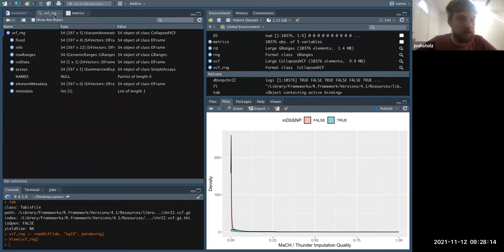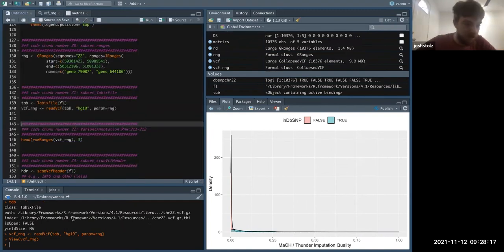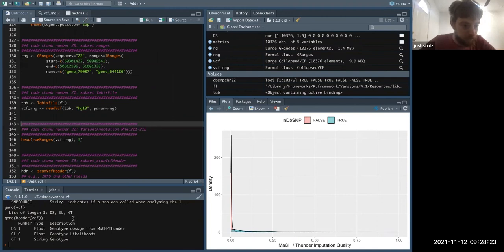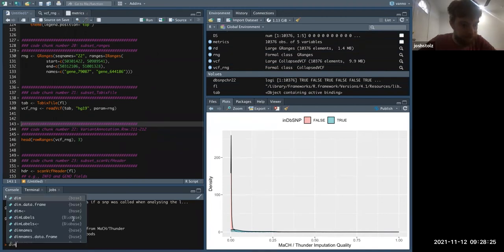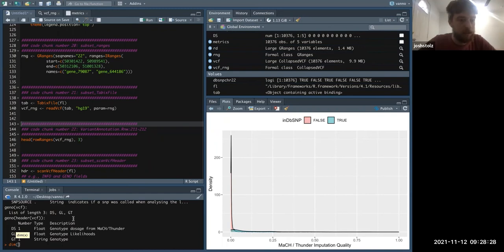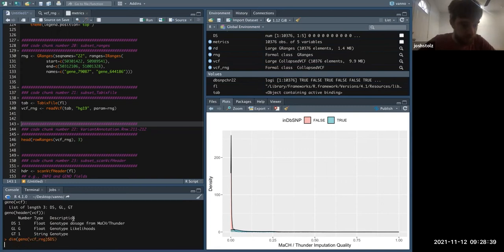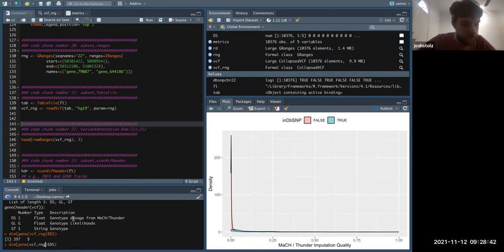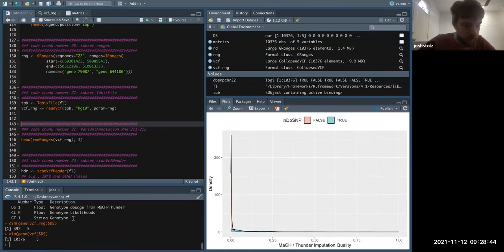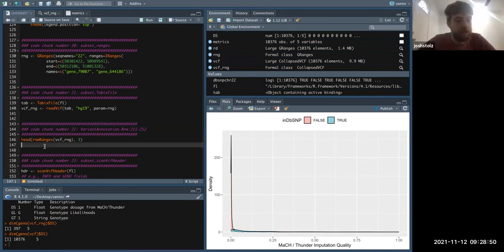This is the same format as our last one but much smaller. So now we have a much more manageable subset of calls from a region of interest.